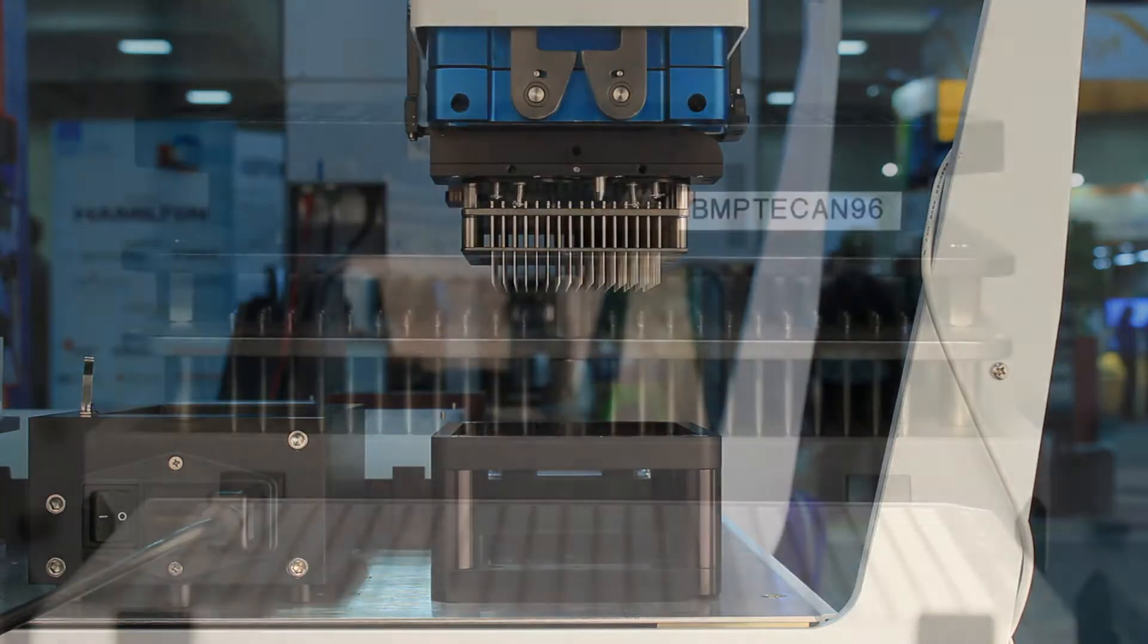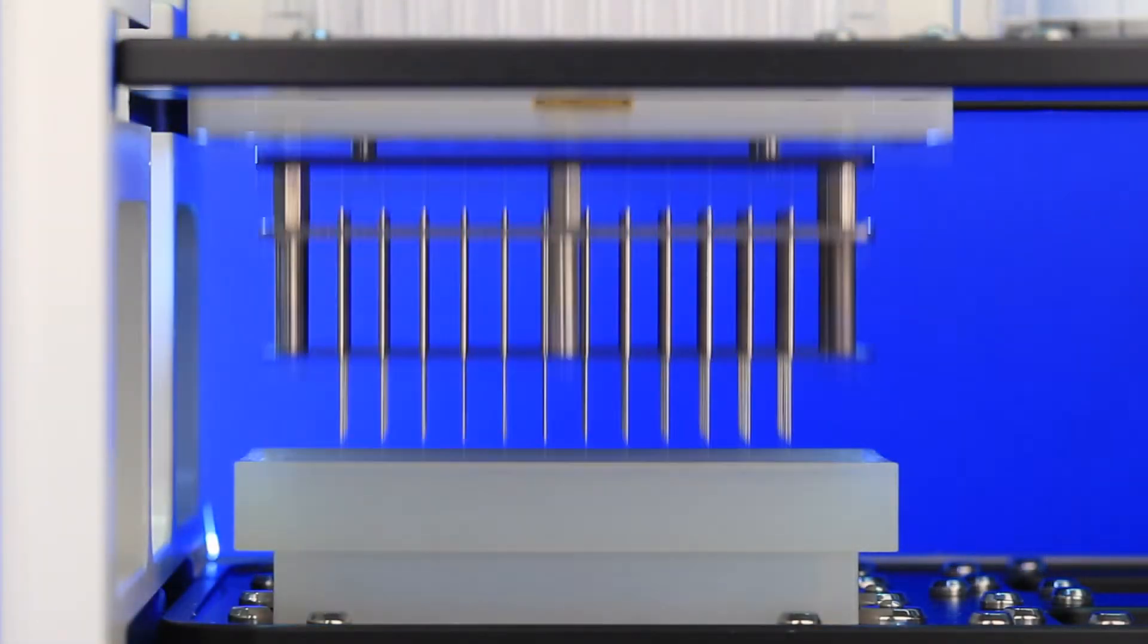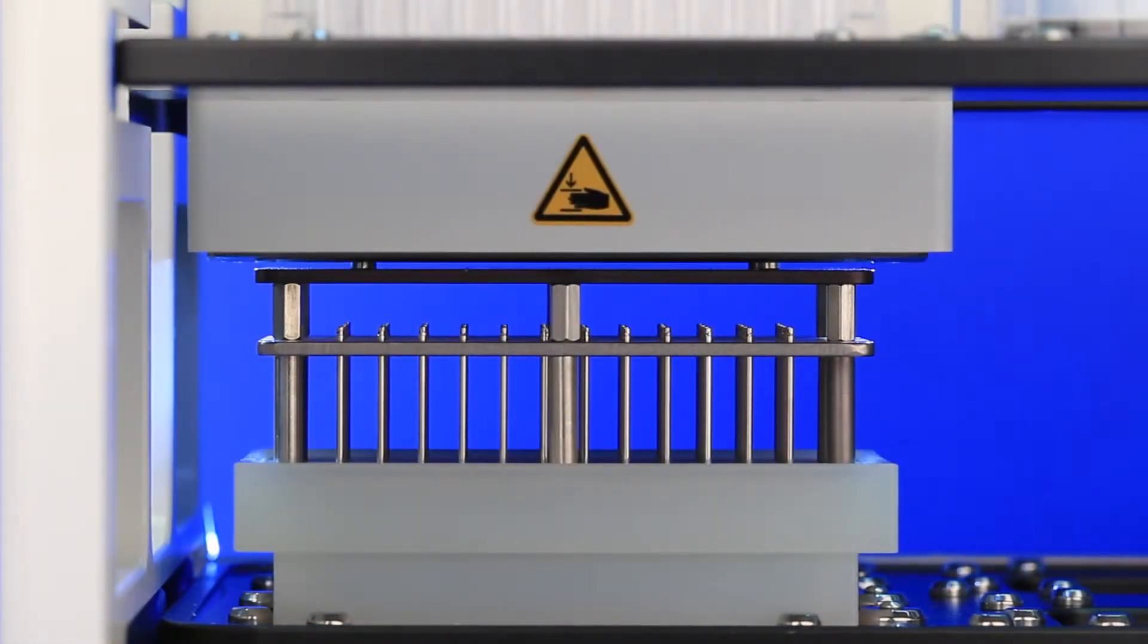VMP's mounting hardware allows for the liquid handler to quickly pick up the pin tool when needed. You can then drop off the pin tool on its docking station and use your pipette head regularly.